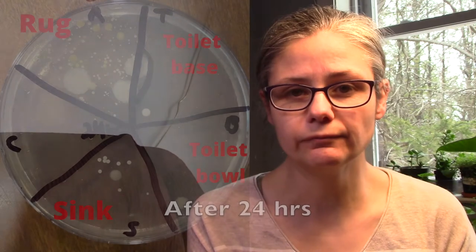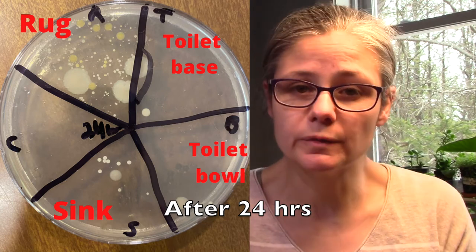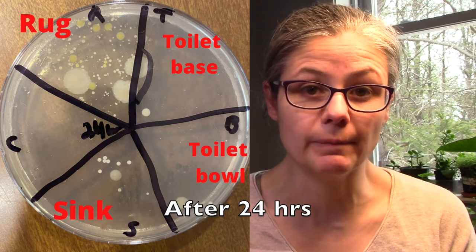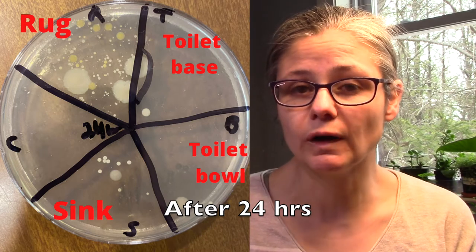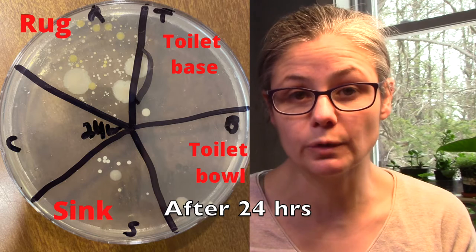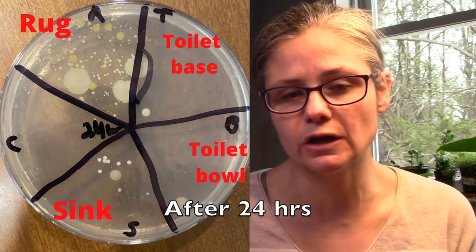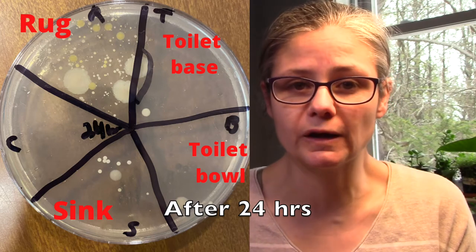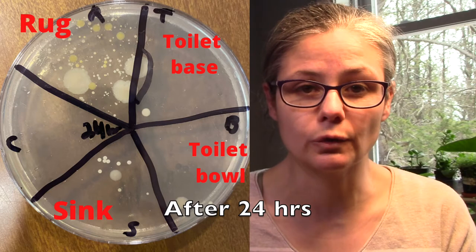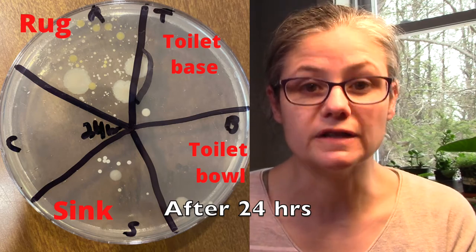I re-swabbed all of these areas after 24 hours. The bathroom rug had the most bacterial growth at the 24-hour mark, so I would say that Microband doesn't prevent bacteria from growing on a bathroom rug. However, on the toilet base and the toilet bowl, there are just a very few colonies, so Microband does a great job of preventing bacteria from growing within that 24-hour timeframe. The sink gives an in-between result — not as much bacteria as the rug, but not as few colonies as the toilet bowl and toilet base. So it does an okay job at keeping the bathroom sink bacteria-free 24 hours after using the product.